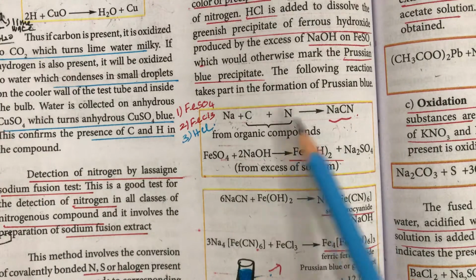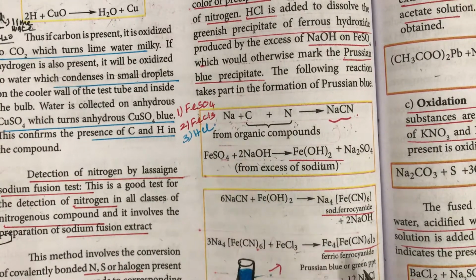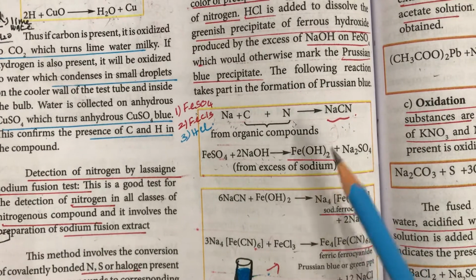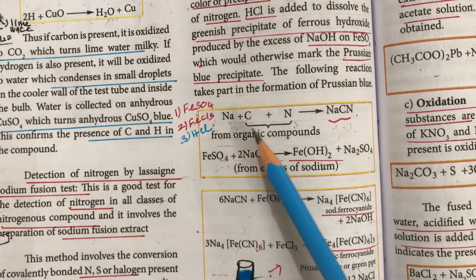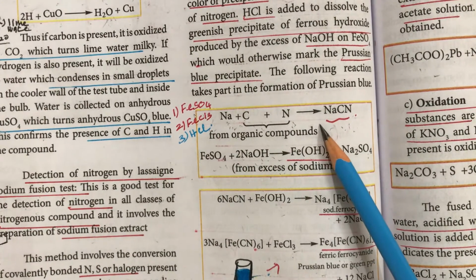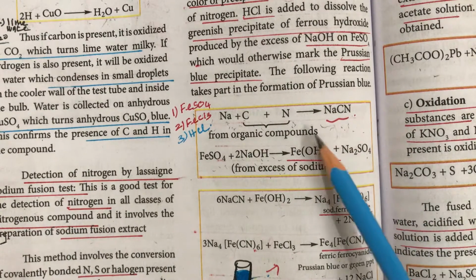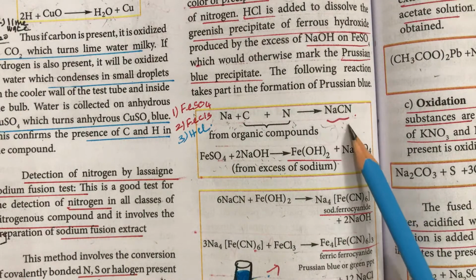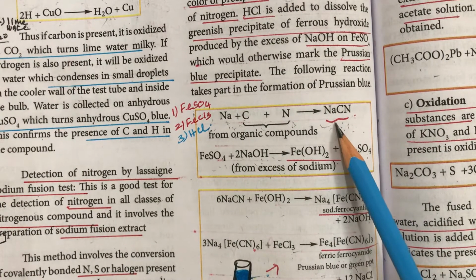So to the sodium fusion extract we add the reagents. The end result is Prussian blue of ferric ferrocyanide. What is the reaction that takes place? Sodium reacts with the carbon and nitrogen to form sodium cyanide. So, for the nitrogen identification, the sodium fusion extract contains sodium cyanide.